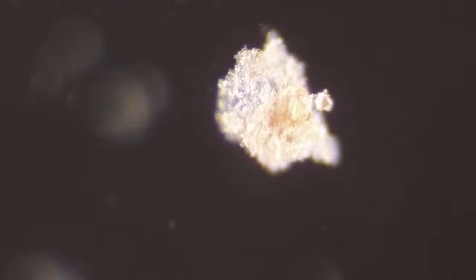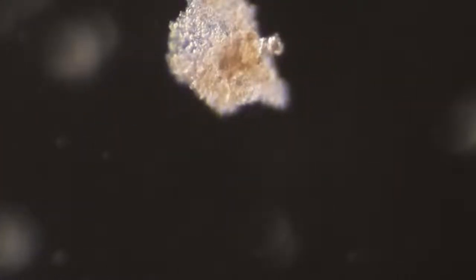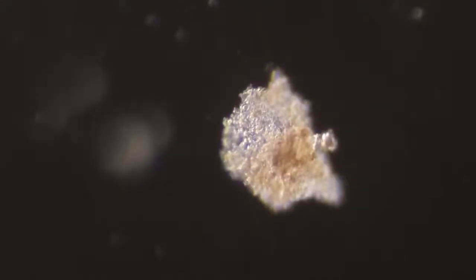There's all kinds of little things dancing around, little flagellates, going in and out of focus. Change the light a little bit, it's too bright. There's a dude going through that debris, a little ciliate, and it took off. All kinds of little dancing dots, those little flagellates, with a little jerky motion.